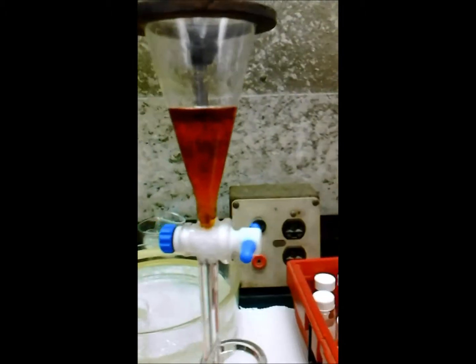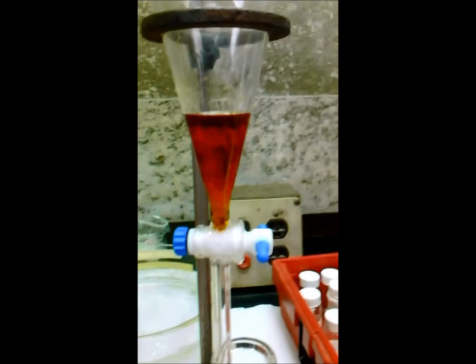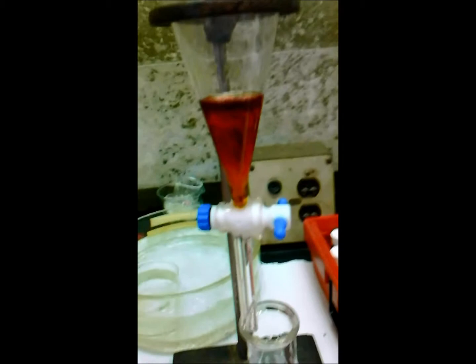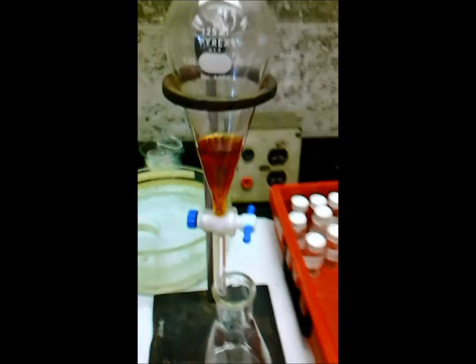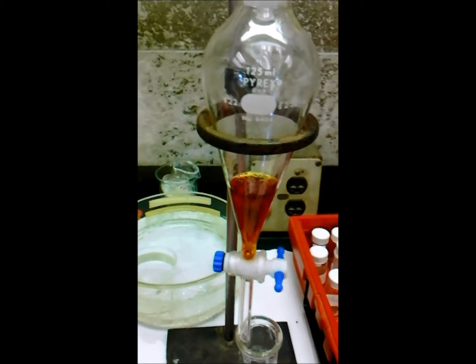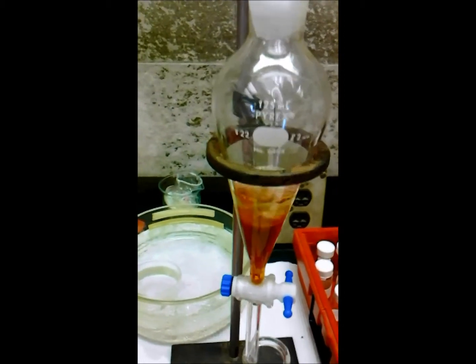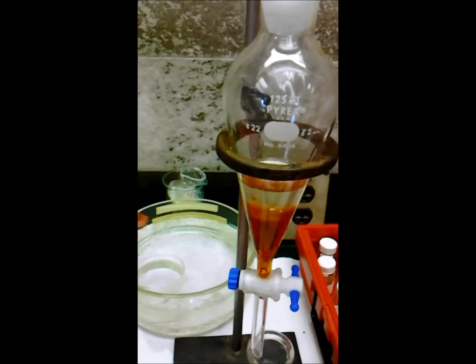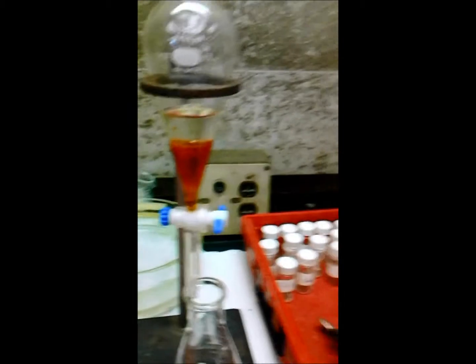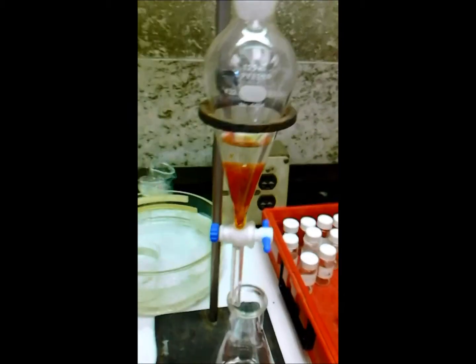Alright, so the reaction is done. I've poured it into a sep funnel. There's some solid crystals floating around in there. Diluted it in a little bit of DCM. And I have 20 mL of 2 molar hydrochloric acid and water, which I'm going to be putting in. I'll actually probably go make a little more of that.